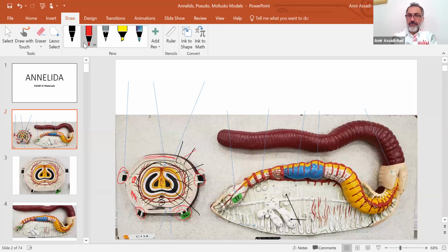Okay. Dissecting the earthworm. So here, this area would be mouth. These are the nerves, cerebral ganglion, and then powerful pharynx. These are aortic arches, these 4 or 5 aortic arches, crop, gizzard, and then outside are chloragogen cells, and then this is calciferous glands, the white area.